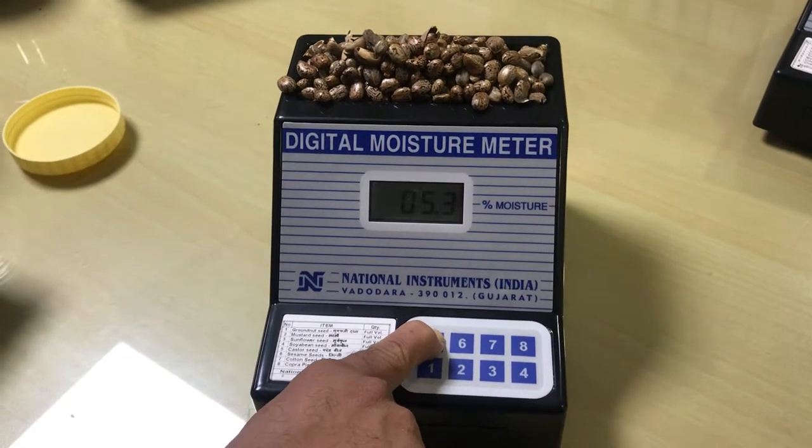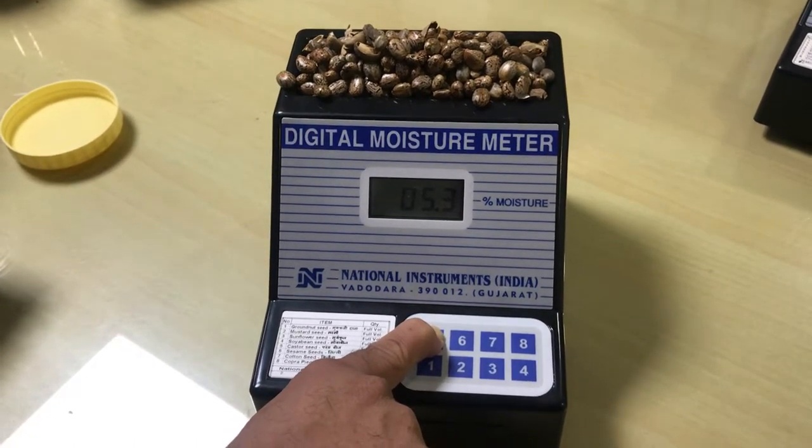This is a very dry Castor seed, and that's all. Here we go.